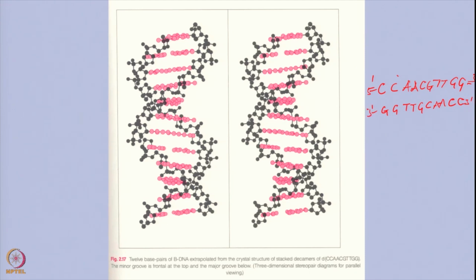So this is called the self complementary sequence, and therefore one molecule which is there naturally goes into the form of a double helical structure like this, and it is easier to work with such molecules. Otherwise you will have to generate two different kinds of sequences and then make a duplex structure. So this molecule was chosen, because it automatically forms the duplex structure as the most stable form, okay. So this is self complementary.